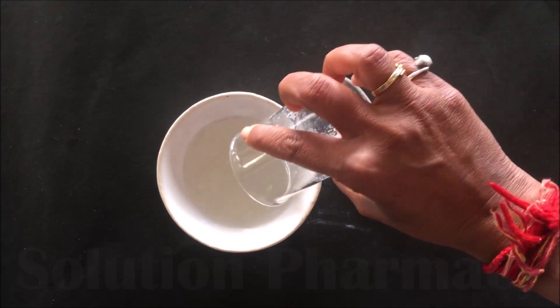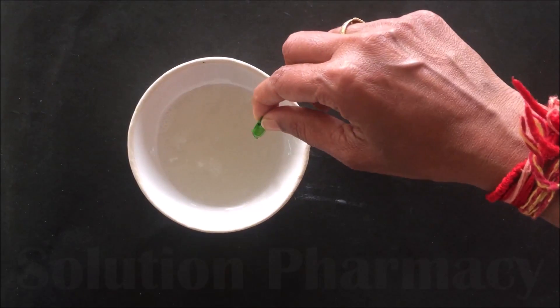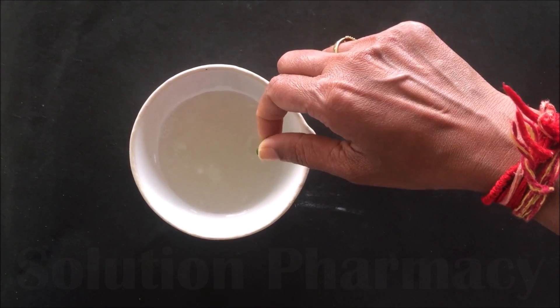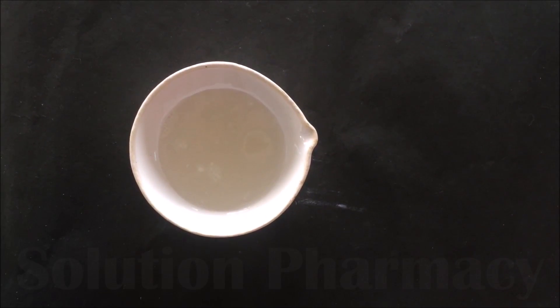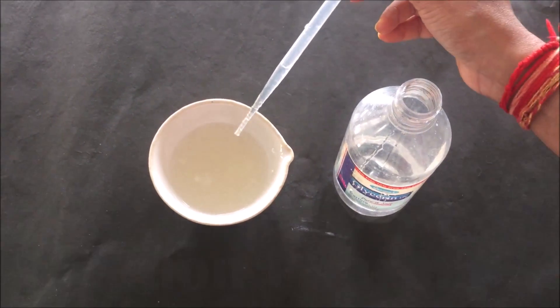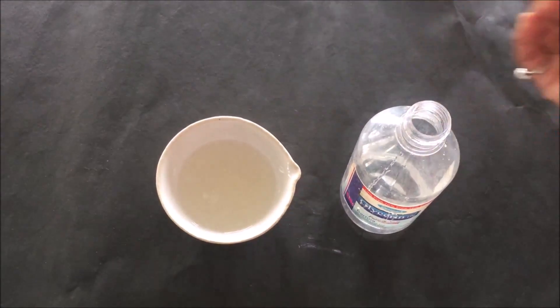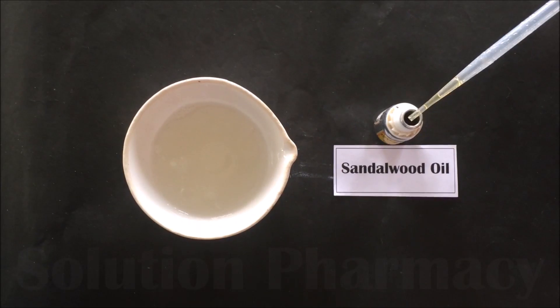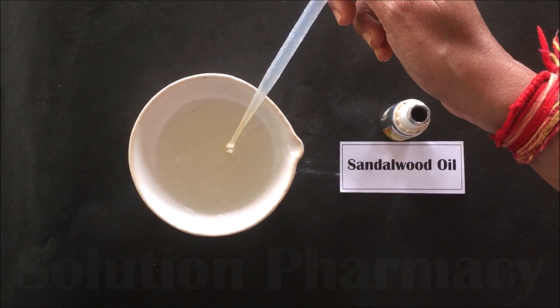After that, transfer this preparation into the china dish and then add one capsule of Vitamin E. Vitamin E has good antioxidant properties and also protects and nourishes our skin. Then transfer 2 ml of glycerin into it; glycerin has good moisturizing property — it moisturizes our skin.